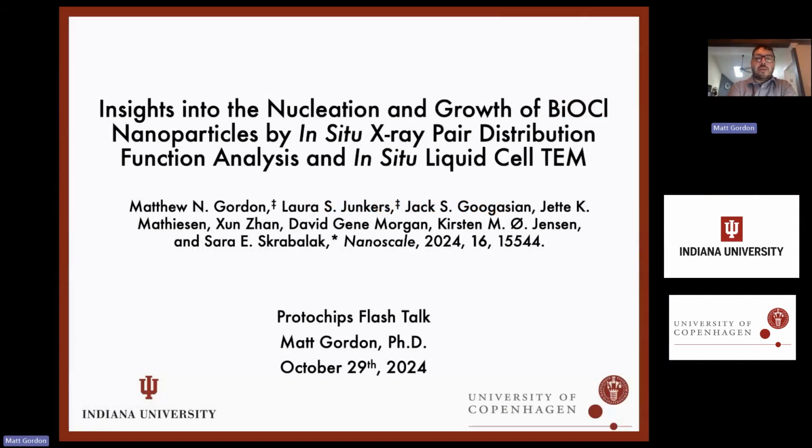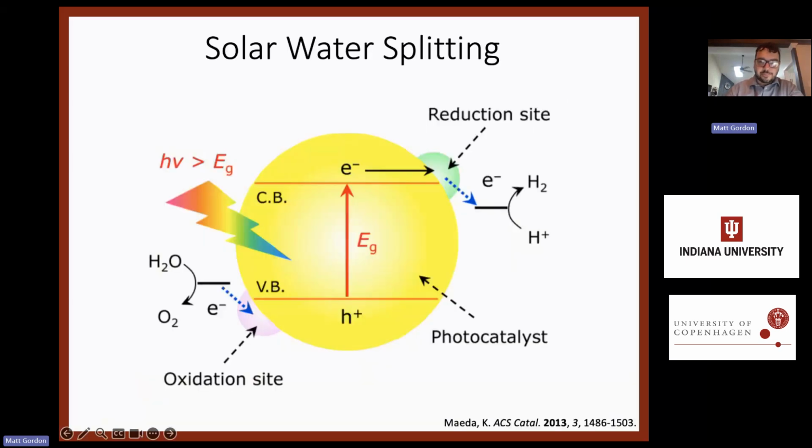Thank you. I'm really happy to be able to present the work that we did on the nucleation and growth of bismuth oxychloride nanoparticles tested by in situ pair distribution function and also in situ liquid cell transmission electron microscopy. This was the final work of my PhD. It was a collaborative effort between Indiana University and the University of Copenhagen. It can be found at this Nanoscale reference here.